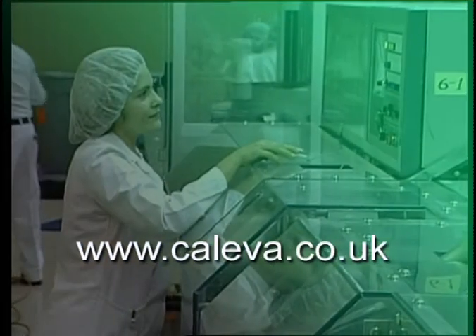This video gives a brief overview of the capabilities and applications of the mixer torque rheometer.